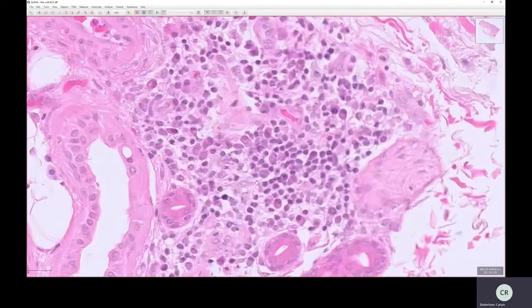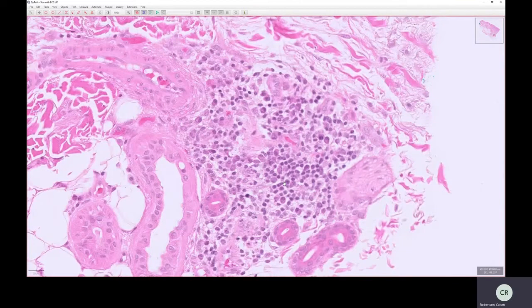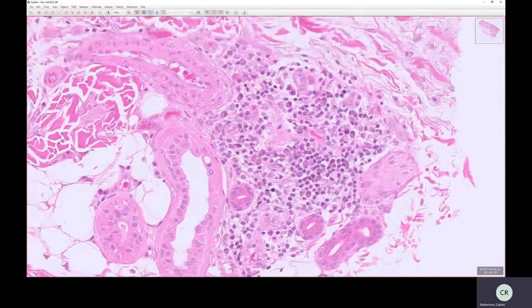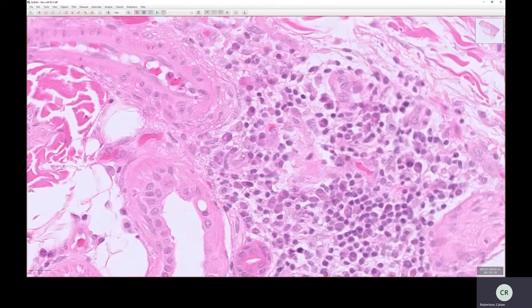But in this section, we can see some more lymphocytes here, inky purple dots, but there's another type of chronic inflammatory cell, which is very common to see and is diagnostically very useful in a lot of circumstances. It's going to be a wee bit difficult to show the finer points of this because it's a wee bit blurry, but let's have a go anyway.